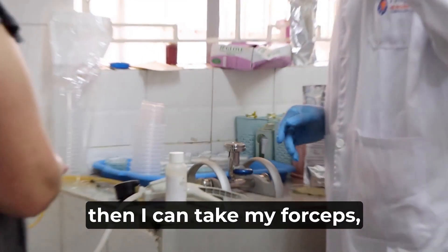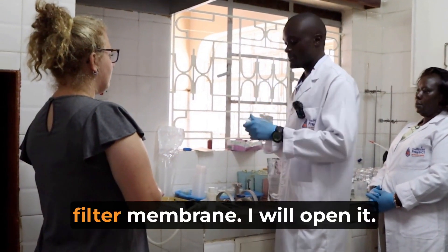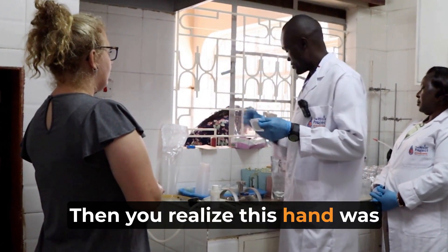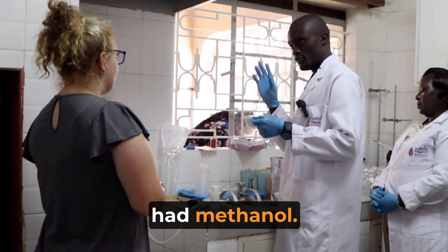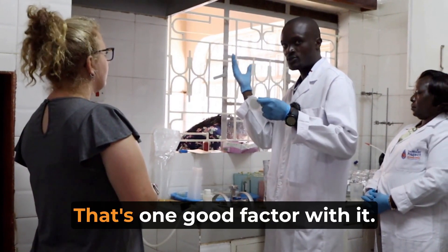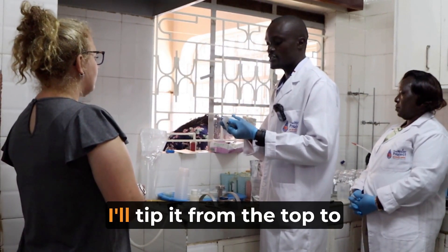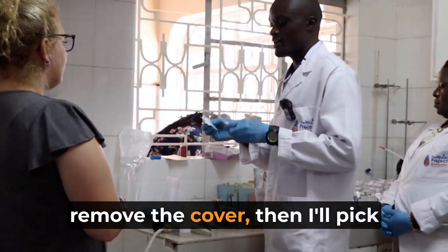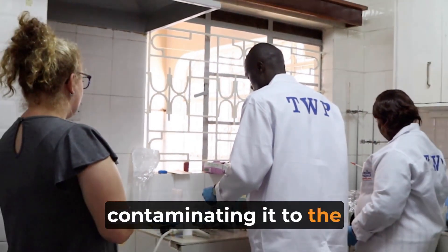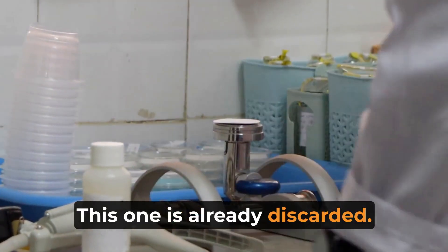After that, I can take my forceps, which is clean, then take my nitrocellulose filter membrane. You realize this hand was holding it and it had methanol, so the fingertips are also sanitized with the methanol — it evaporates very fast, that's one good factor with it. So once I have opened it, I'll tip it from the top to remove the cover, then pick it with the forceps without contaminating it and place it on top of the milipo. Then I'll return my forceps — this one is already discarded.